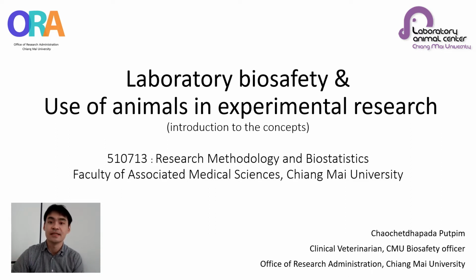The second is the biology of laboratory animals, with rodent and rabbit handling practice. The third is substance administration by many routes, euthanasia, how to necropsy, and how to sample the organs. In each course, you receive a certificate of achievement if you pass the criteria, like the biosafety course.